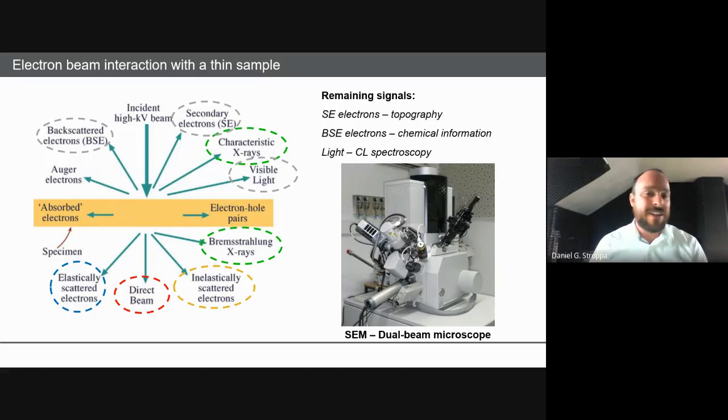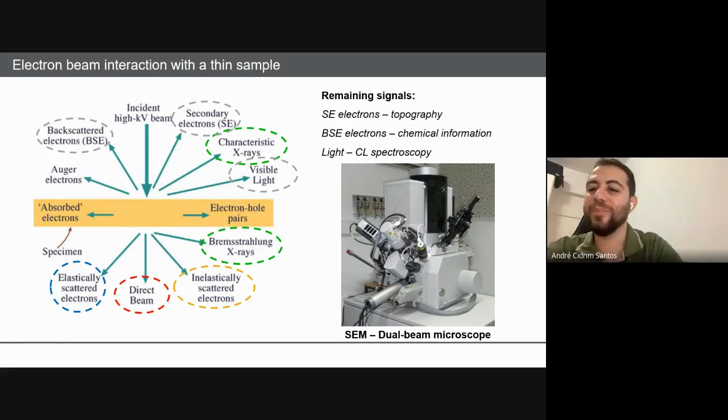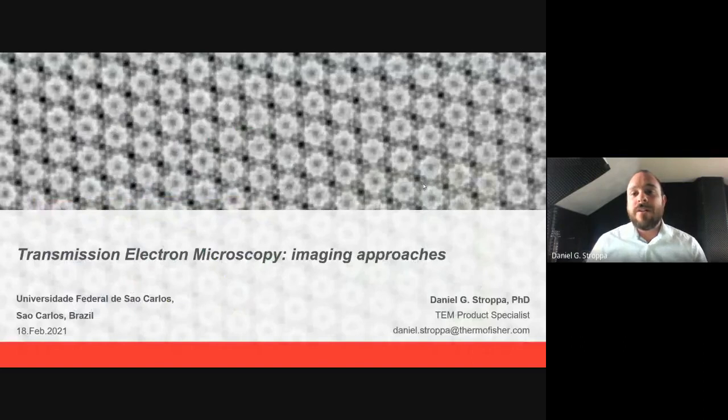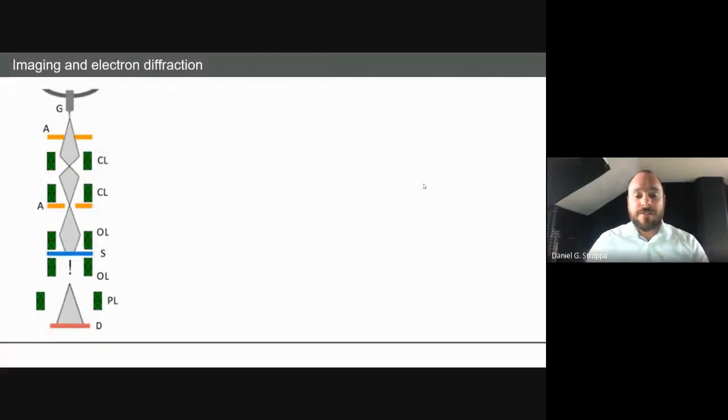So I'll start here first with the TEM mode. That's the one that is the most traditional, or used to be the leading one. And the idea here, in this depiction of the electron microscope, you have the gun at the top, you're emitting electrons, and you're going through this CL region, that's the condenser lens setup, and then you're going to get to the sample, that's the blue line here. And in TEM mode, we want to land a parallel beam over the sample.